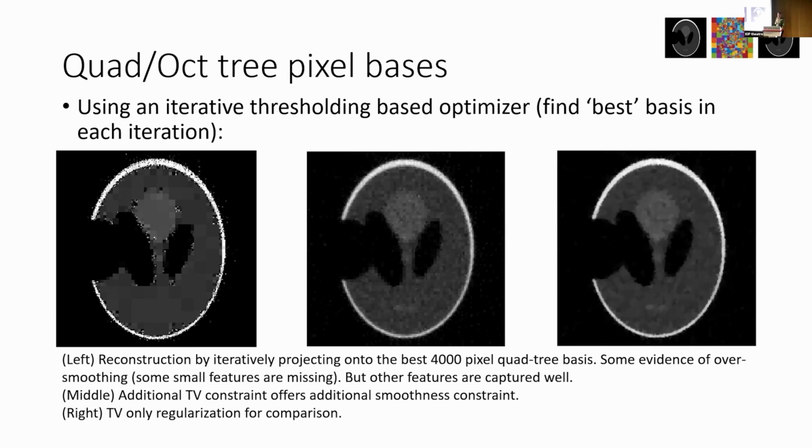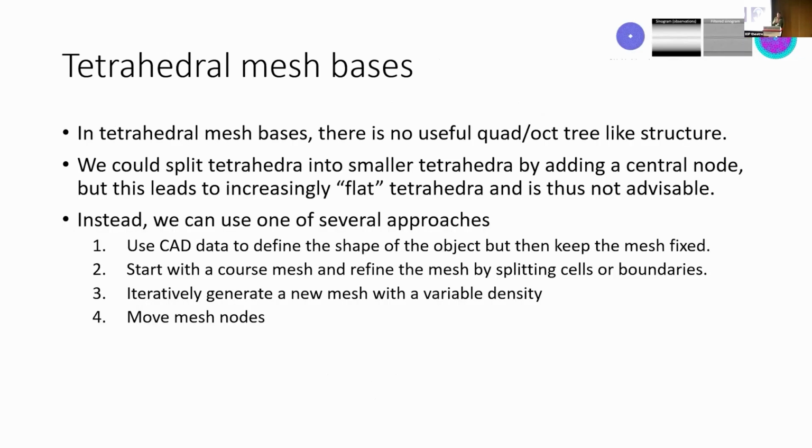So just having a variable basis doesn't suffice, because sometimes you get very small approximations, so small errors. Having some smoothness introduced through total variation does help. All right, so with these kinds of variable size voxel type representations, that's probably the best way.